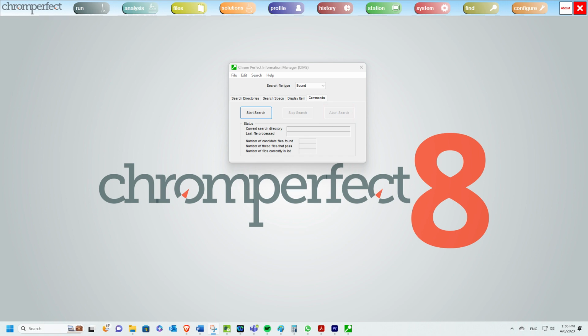When there are a lot of files in the search directories, the search may take several seconds. Usually, each file is processed in less than a second, but large bound files may require several seconds. The status frame displays the progress of the search. The first two lines indicate the current search directory and file name. Below that are listed the number of candidate files found so far, and the number that passed. These numbers normally increment rapidly during a search. A pause indicates that the current file is unusually large. The last line indicates the number of files in the list.